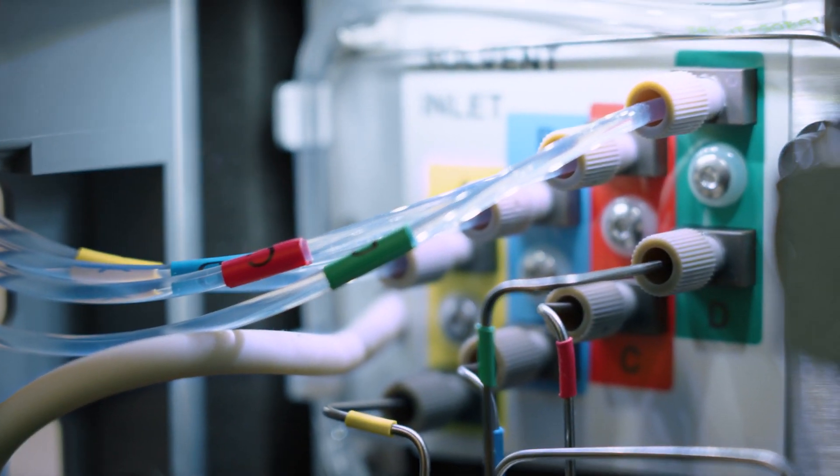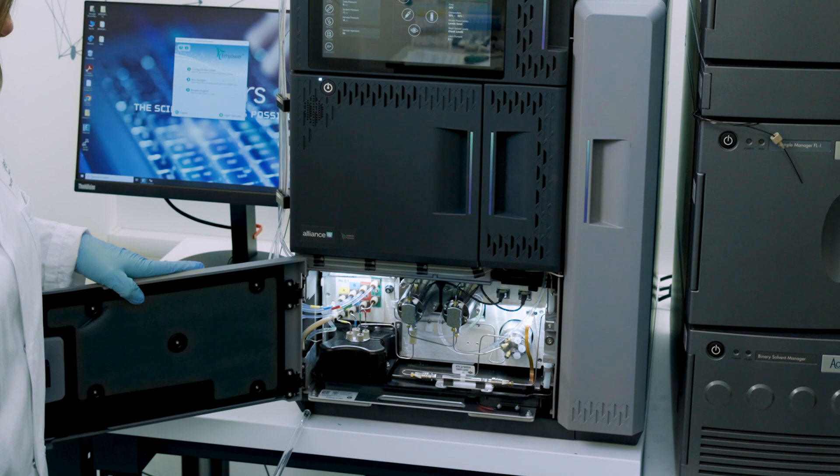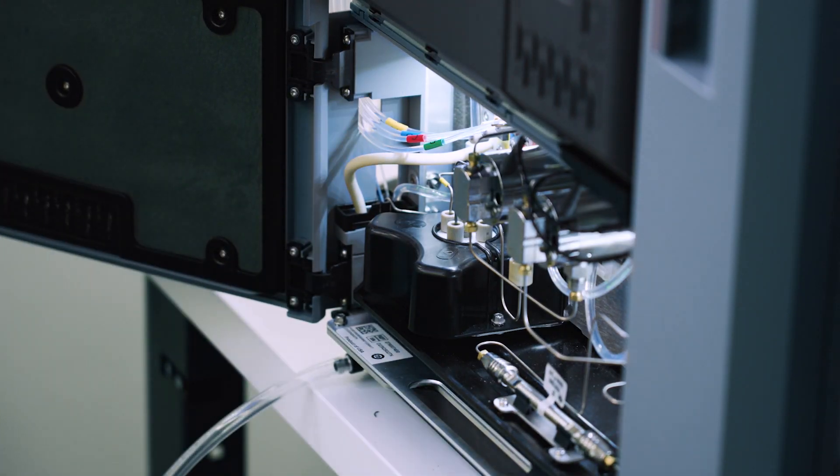As you can see, the solvent lines entering the pump are well labelled. Should any issue arise with the pump, the aim is to get it up and running as quickly as possible. To do this, accessibility is important. As you can see, a light comes on when the door is opened, clearly illuminating all parts.